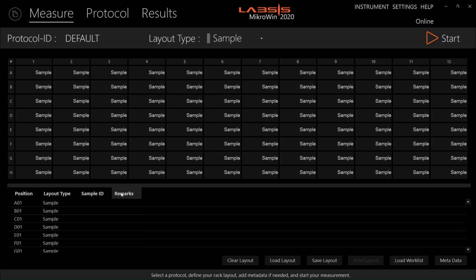Second, pay close attention to choosing the correct data type. If you want to use a column for calculations, such as a dilution factor, it is mandatory to select a numerical data type. For sample IDs or patient names, it is best to choose the text data type.